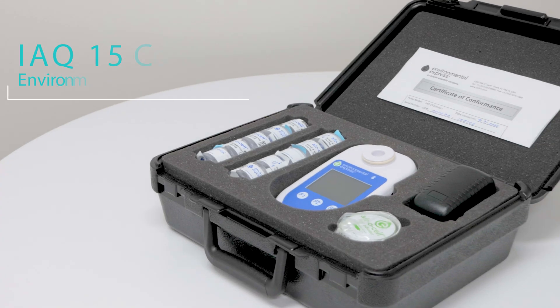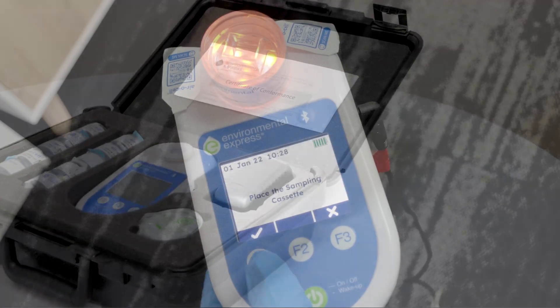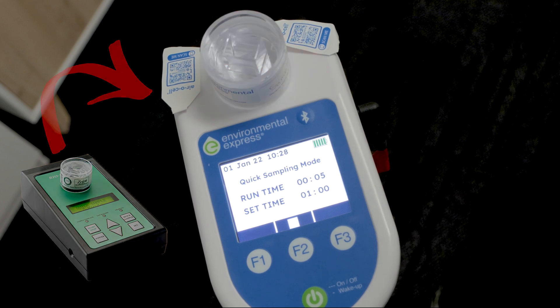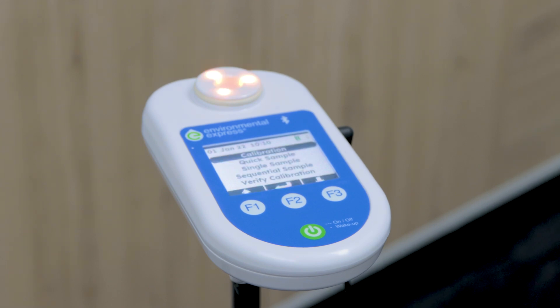Hi, I'm here to introduce the iQ15 Connect by Environmental Express. The iQ15 is the long-awaited follow-up to the popular Zefon Biopump. Featuring a new compact design, colour screen and long-lasting battery, the iQ15 makes the perfect mould sampling pump.